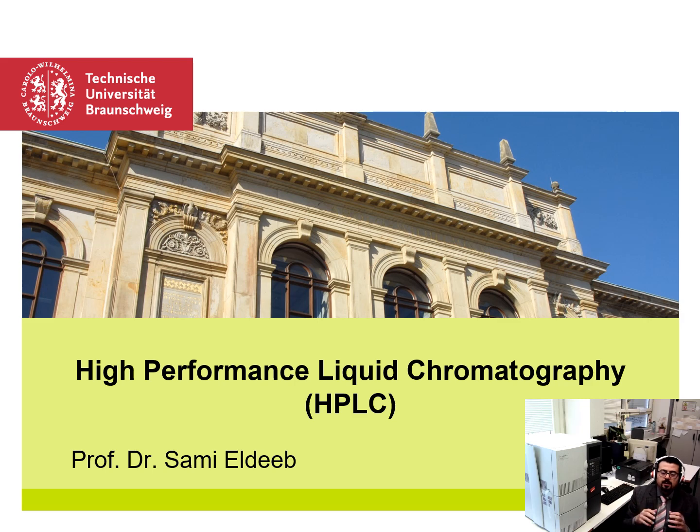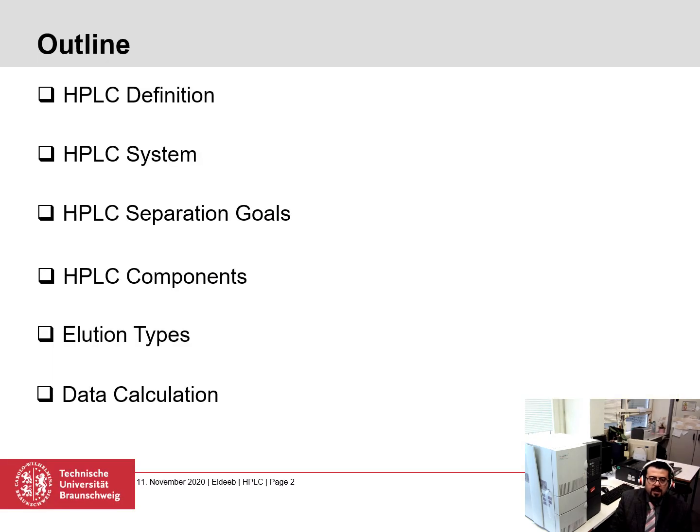Hello everybody, the topic of my presentation is High Performance Liquid Chromatography, HPLC. I have structured my presentation as follows. First I will define the HPLC, then I will show you the HPLC system, talk about the separation goals, describe the components of the HPLC and the elution types, and finally talk about data calculation.